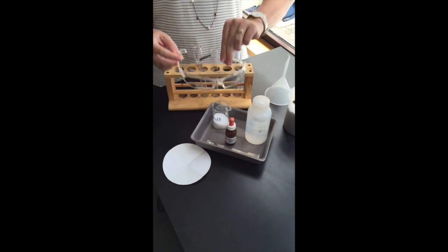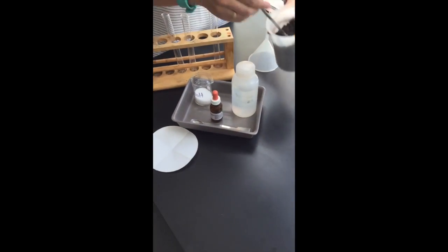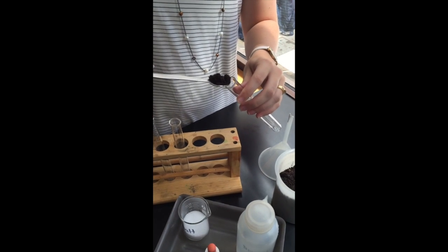In this experiment we do need to wear glasses because we are using silver nitrate, which is quite toxic. We need to make sure that we don't get it onto our skin or clothing, and that we wash our hands carefully afterwards.